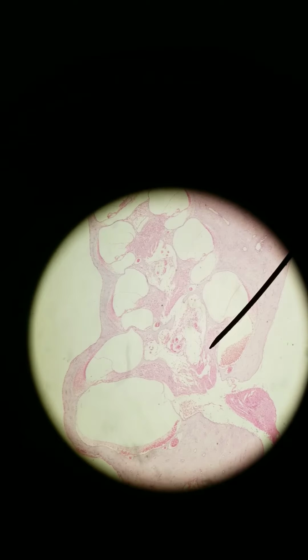Hey everybody, we are taking a look at the histology of the cochlea, C-O-C-H-L-E-A. The cochlea is the inner ear organ for hearing. There's another inner ear organ for vestibular sense. We'll get to that later, but this is for hearing. So we're at 40x right now.